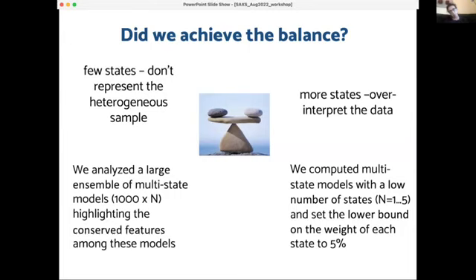So all those combinations are probably valid, and without additional criteria or without, let's say, an orthogonal data set, we cannot exclude any of them. If we have additional data, let's say cryo-EM or cross-linking, then we can start maybe excluding, but without additional data, this is what we have. And I think this represents quite well what is going on in solution for those flexible systems. Okay, thanks.